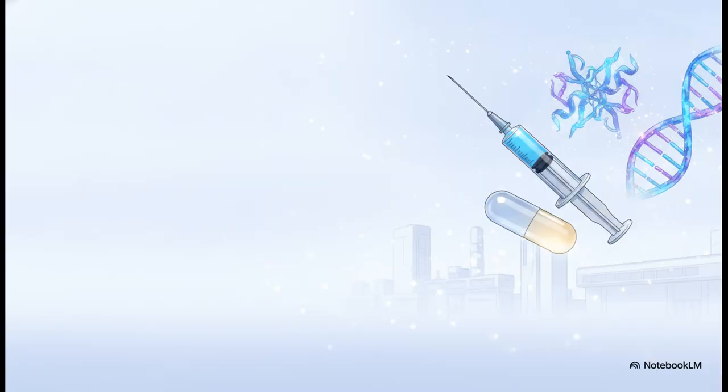And the real-world applications for this level of specificity are absolutely profound. I mean, affinity chromatography is basically an indispensable backbone of the modern pharmaceutical industry. It's mandatory for the large-scale therapeutic manufacturing of antibodies, enzymes, and recombinant proteins. Honestly, without this technology, the safe and rapid mass production of life-saving vaccines and advanced biopharmaceuticals simply wouldn't be possible. It's the absolute driving engine behind bleeding-edge biotechnology research, proteomics, biomarker discovery, and clinical diagnostics.